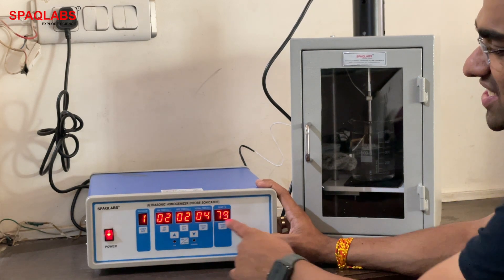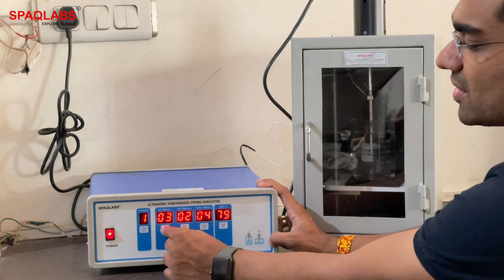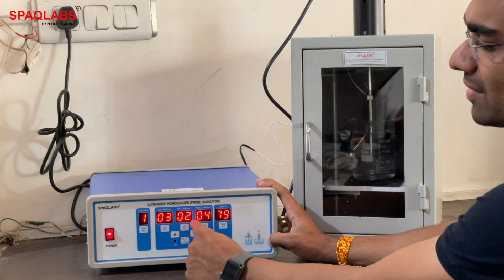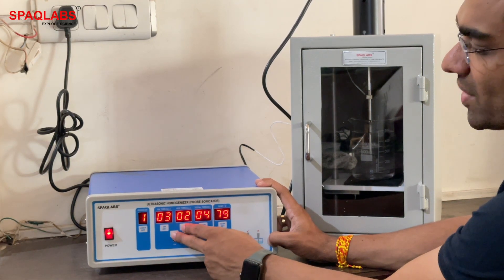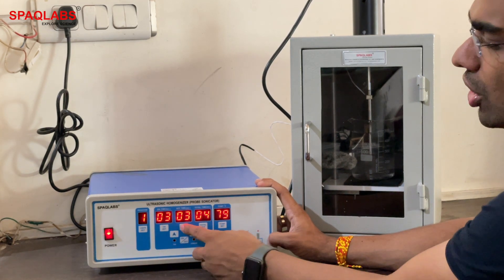Now let's see how to change the parameters. Press and hold to adjust on time — pressing the up button will increase it. Similarly for off time: press and hold, then press the up button to increase. Press down to decrease the offset value.